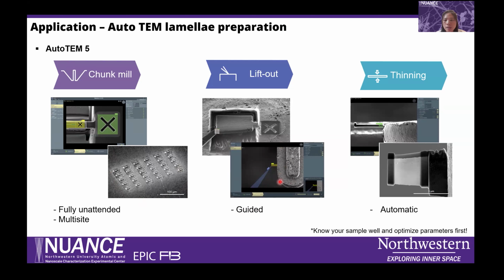do all the things. And for the normal top-down thinning that we usually do, it can also be done automatically to the specific thickness. But if you want to make sure of success, please know your sample very well and optimize the parameters first before you try.